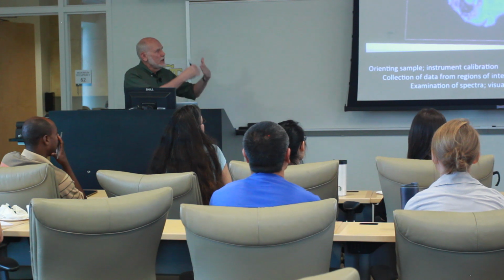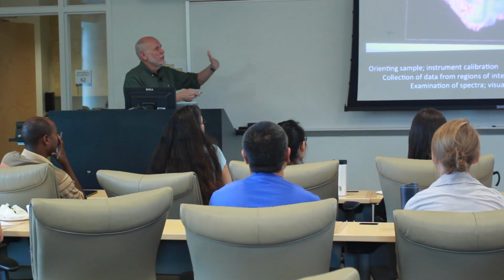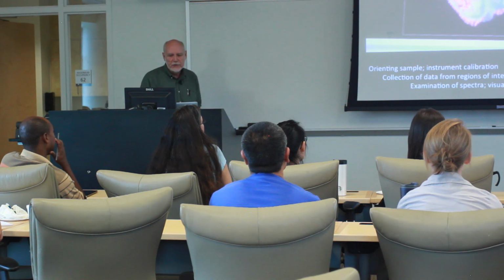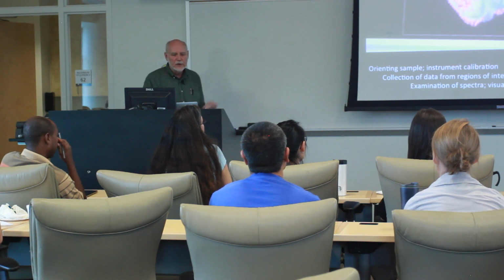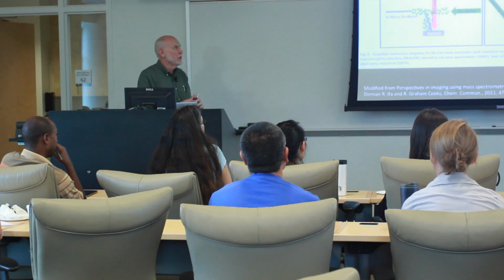And with this instrument, you do consecutive slices of tissue. So you'll have the one that was right next to this, 8 microns or so away, that you would put on another microscope slide and do whatever characterization of it that you feel is necessary to match what you're seeing with the mass spec imaging with the general view of what the tissue looks like.